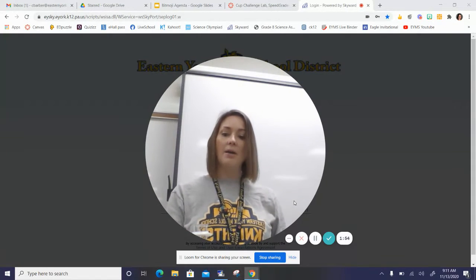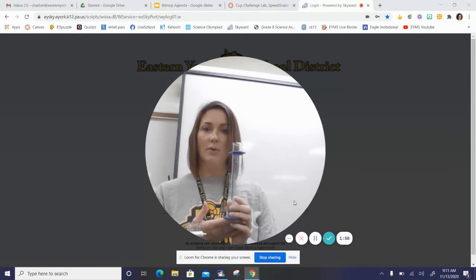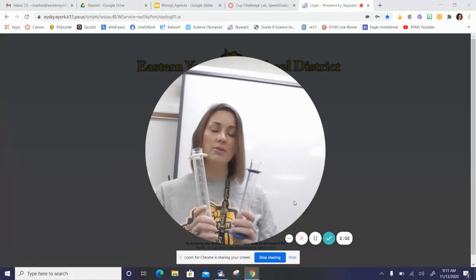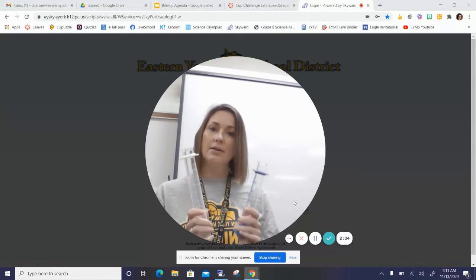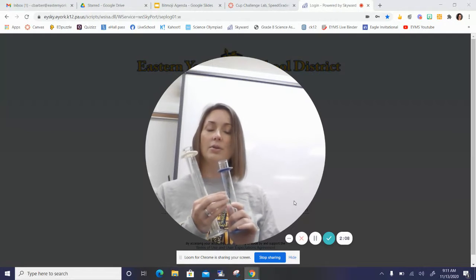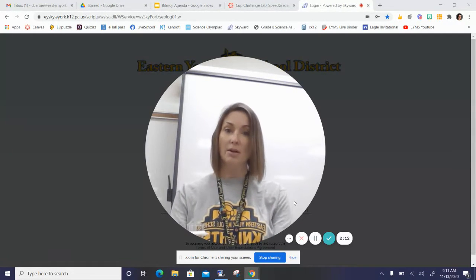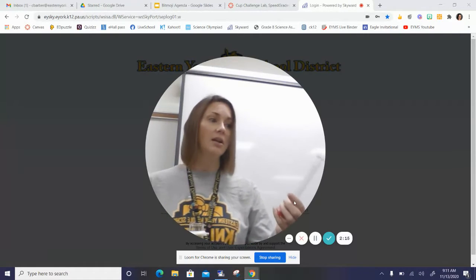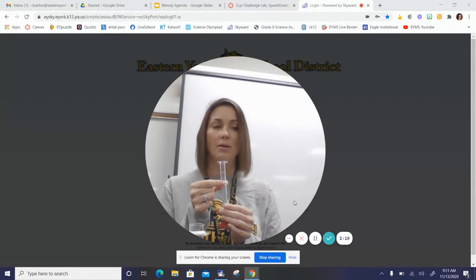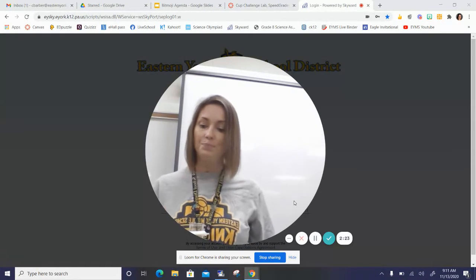If you then needed 36, you would use a graduated cylinder, because the graduated cylinder, this one here and this one, they both are counting by ones. So you can get exactly 36 milliliters with your cylinder because the cylinder has all the little graduations, or subgraduates, that you can measure to the nearest milliliter if necessary. And even with the smaller ones, you can measure to the nearest tenth of a milliliter. These smaller ones have smaller graduations.